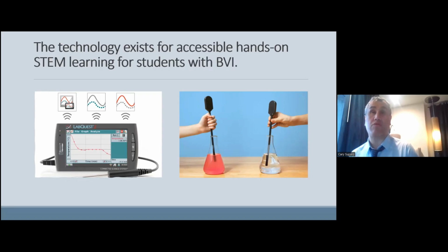And so as your solution, say it's the iodine clock reaction, starts at clear, it'll have a high tone, and as it goes from brown to darker colors to eventually black, the tone gradually drops. And the audible tone communicates to the blind student approximately when the color changes are occurring. And of course, we all know this is a chemical kinetics experiment, so your concentrations as you vary them with your starting materials will impact reaction rate. And as a result, the blind student can record time intervals by which the color changes are occurring with the SALS. So SALS is a wonderful thing.